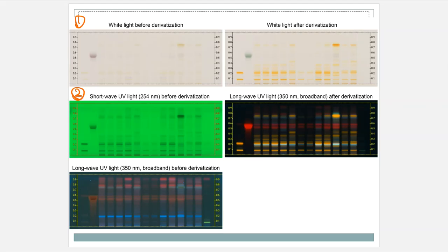That zinc compound is going to be a glow in the dark, again, Teenage Mutant Ninja Turtle green color. And then my components that are absorbing the UV light, it's going to absorb those areas. And because of the absorption, it is kind of somewhat sucking all that up. And we see dark spots wherever those samples are located.